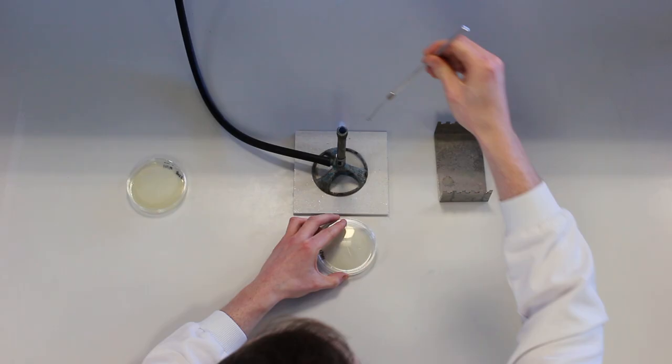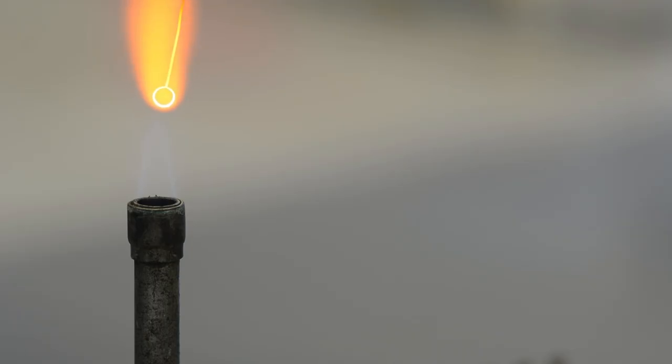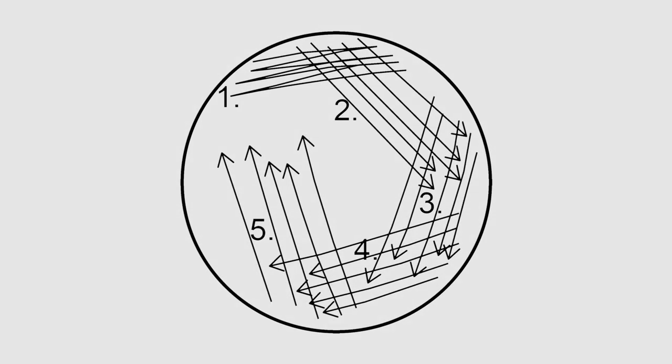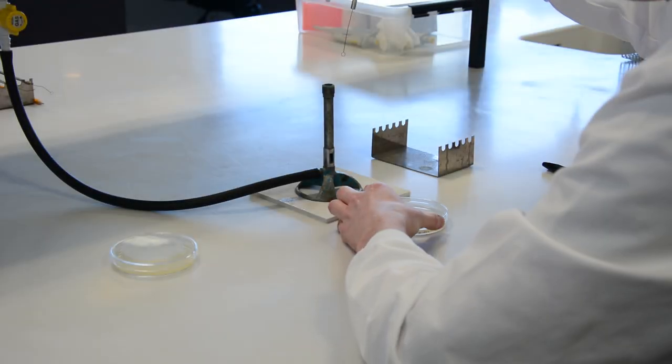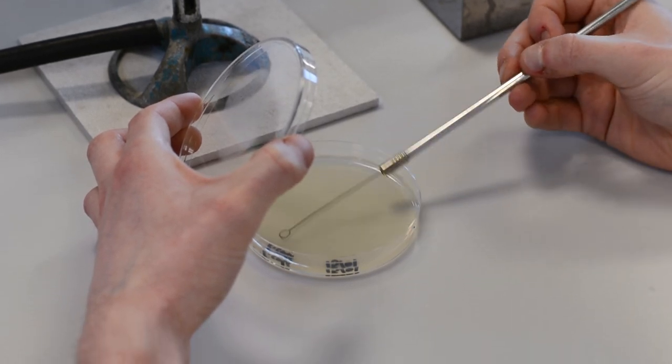The material which we have just transferred to the plate is now known as the inoculum. The loop is sterilized and cooled again before some of the original inoculum is now moved across the plate, as represented by part 2 on the drawing. Make several parallel strokes, a few millimeters apart, covering about a quarter to a third of the plate.